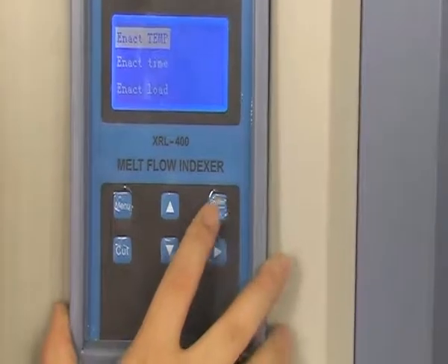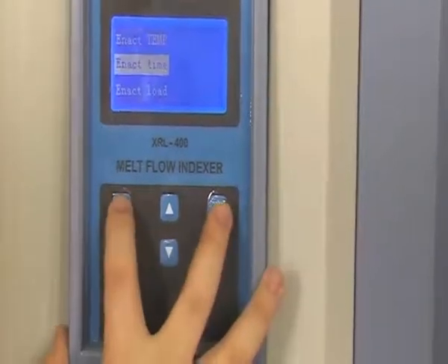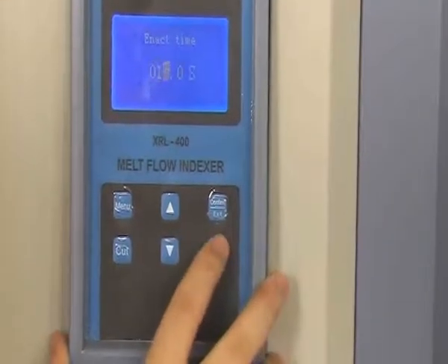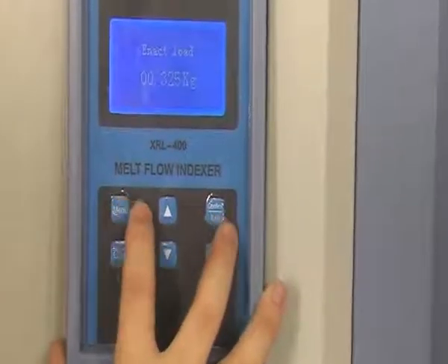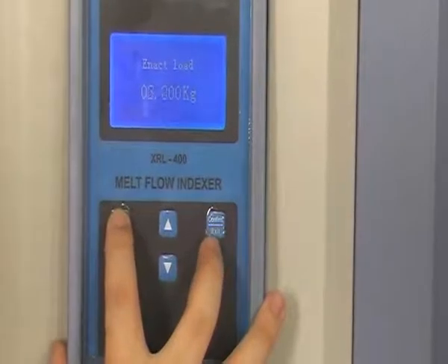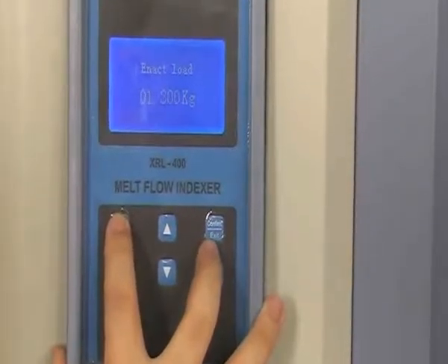Next, let's come to the set interface. Press up and down to set the temperature, time, and load separately. Press menu to enter the temperature setting interface. The time setting is the same as temperature.